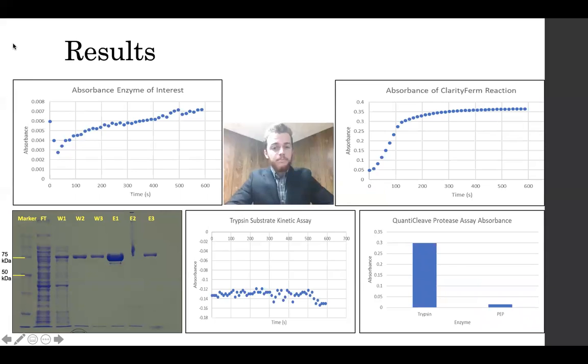Now looking at the top, you have at the left-hand side, a typical absorbance pattern for the kinetic assays with the H-alanine-phenylalanine-proline PNA substrate. So there is a quick drop right at the beginning, but a slow increase in absorbance. It's not that much, so very little activity is actually being detected.